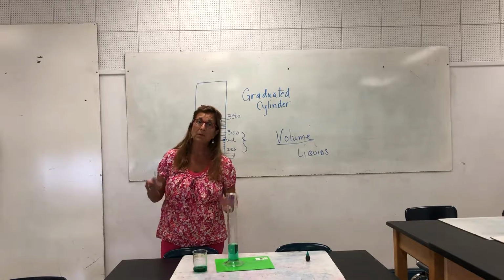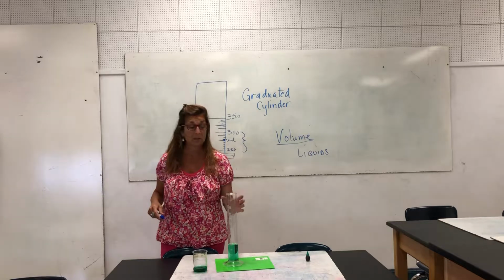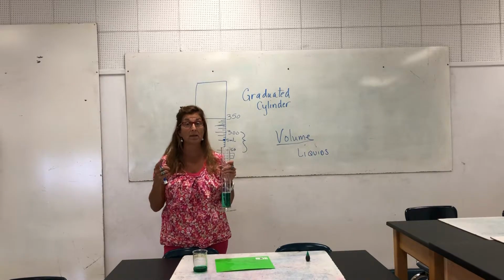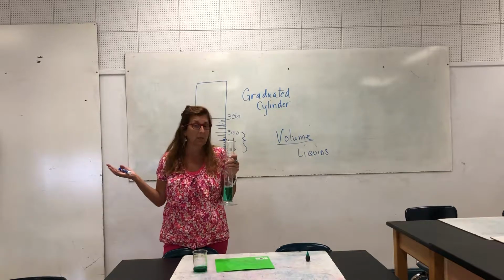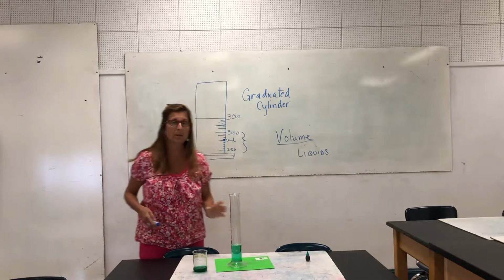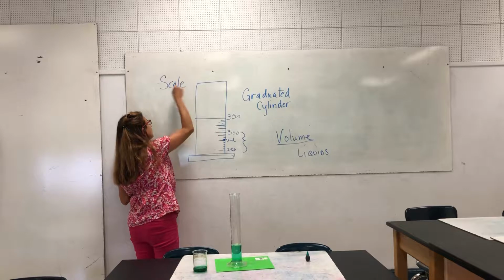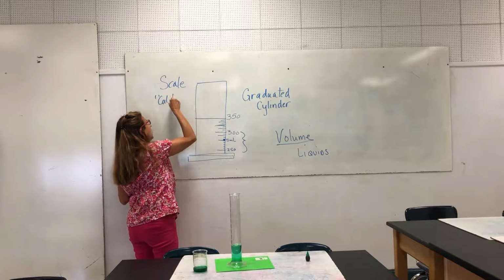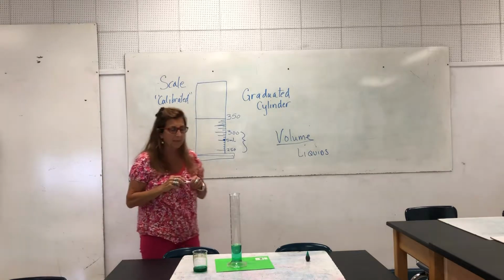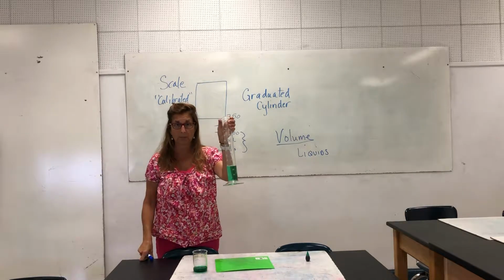So all different size cylinders have different size graduations. Some cylinders, every mark will be worth 1/10 of a milliliter. Some will be worth 1, some will be worth 5, some might be worth 10 milliliters. And so you're going to have to determine that based on the scale or calibration of your cylinder. So there's a scale for each cylinder. We could call it, how is the cylinder calibrated? So this one is calibrated to 5 milliliters per mark.